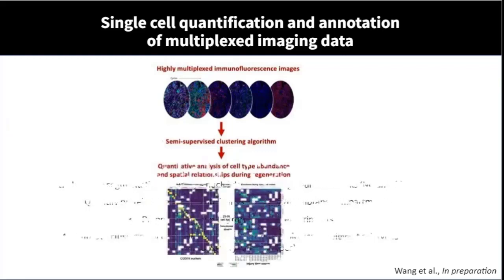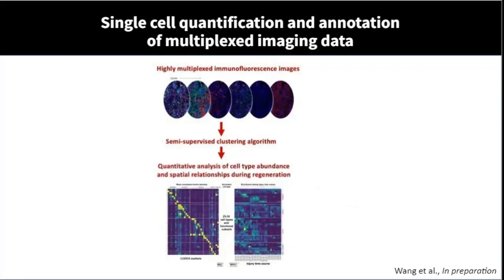And so you can see that in a tissue like skeletal muscle regeneration, we've got roughly 30 to 40 tissues that we've imaged across multiple runs. And across these runs, we're able to identify about 25 to 30 functionally distinct cellular subsets. And you can see with marker expression, each of these markers are able to identify the population of cells that they're looking for.